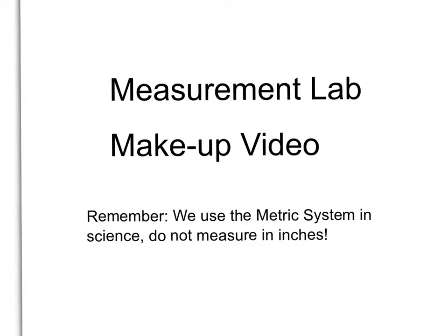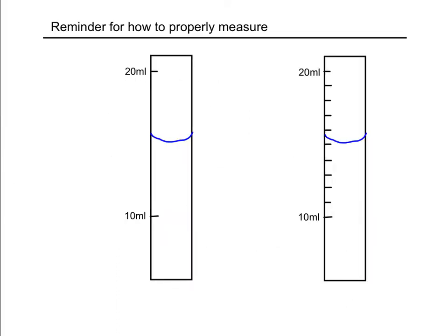This is going to be the makeup video for the measurement lab. Please make sure you have your measurement lab open. This is going to be a quick reminder of how we properly measure using a graduated cylinder or any device.